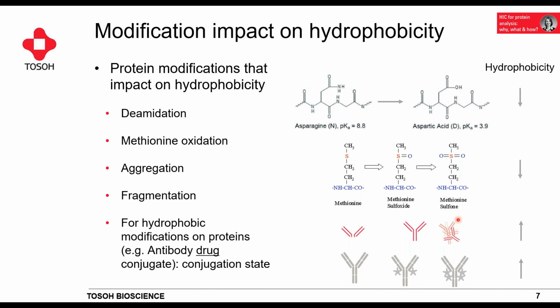Last but not least, and this is common sense, I would assume, if we modify our molecule, in this case an antibody, with a chemotherapeutic drug, for instance, which is more hydrophobic, we also add hydrophobicity to the molecule and increase the overall hydrophobicity of our molecule.